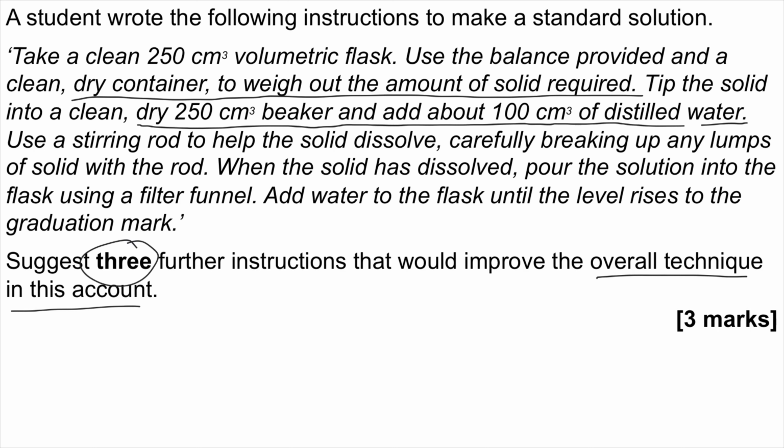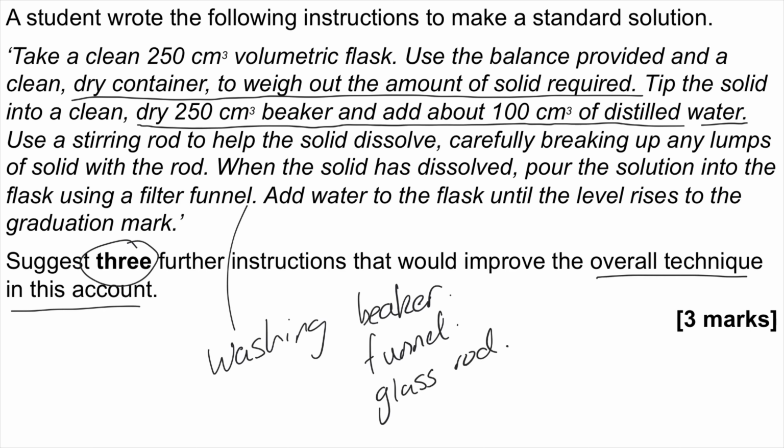So that's where you would add some more distilled water to the beaker, pour that into the filter funnel, into the flask. We've not got washing of the filter funnel. And we've not got washing of the glass rod. So there are 3 washings there that they've not done that we could add as well.